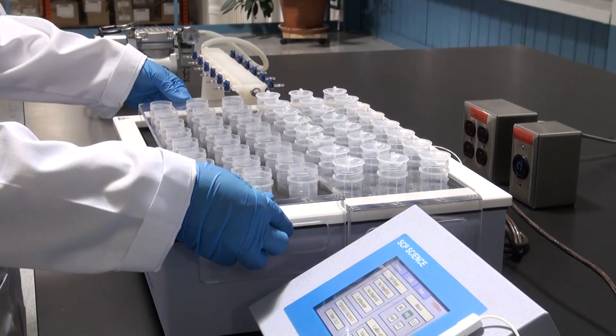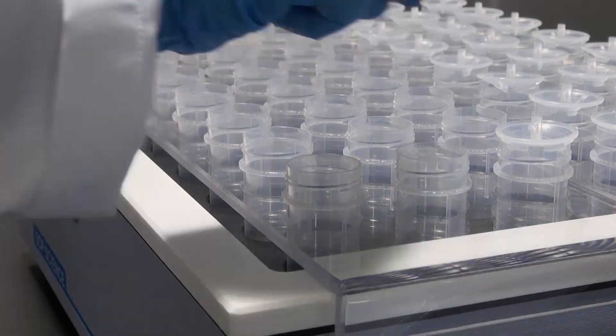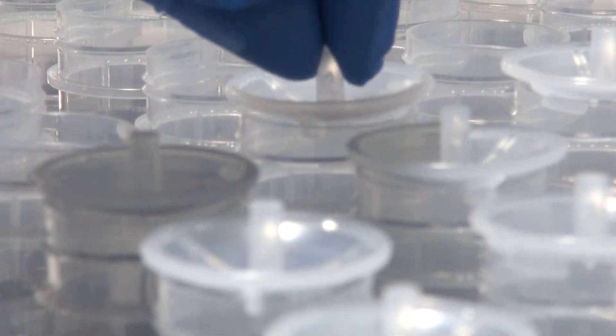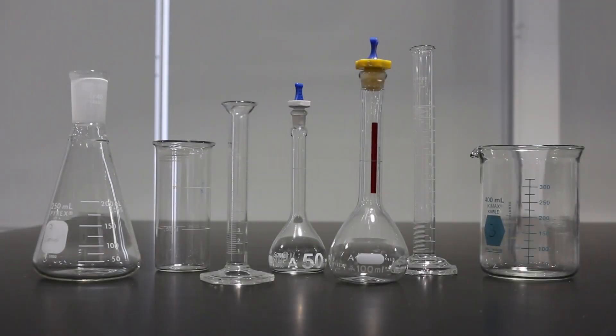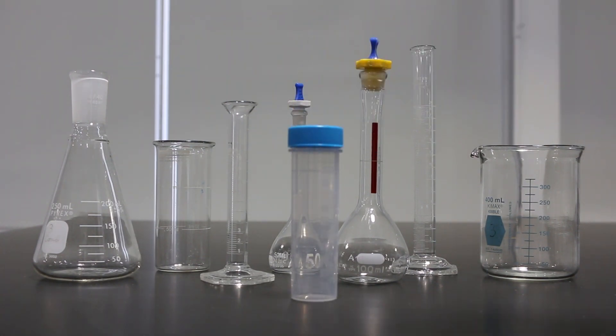Digitubes and watch glasses are manufactured of ICP-MS grade polypropylene, tested in our ISO 17025 accredited laboratory. The graduation mark is certified accurate in accordance with ASTM Class A volumetric standards. Several pieces of glassware can all be replaced with just one Digitube.